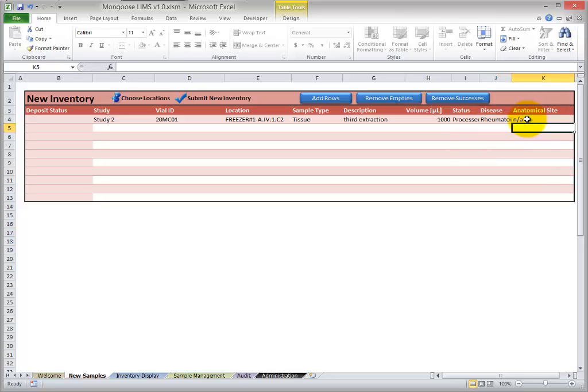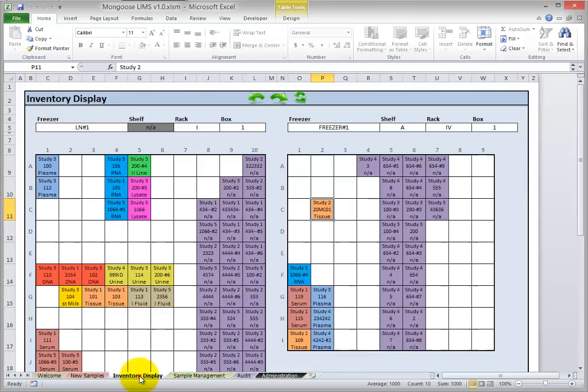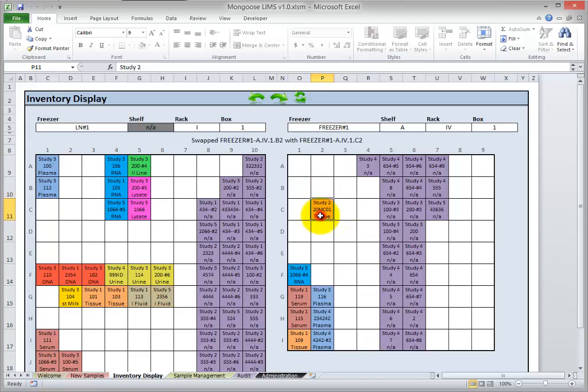So there's all our information. Let's click Submit. So it looks like we are successful. Let's go look at our new sample in the Inventory Display. So there it is. There's your tissue sample. And obviously you can move this around just like the other samples.